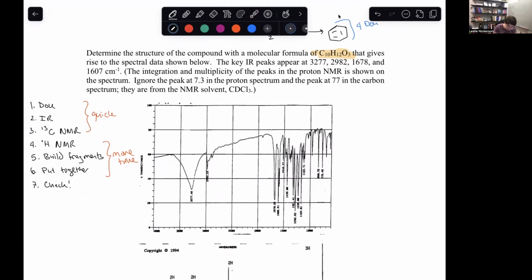Next up, we're going to look at the IR very briefly. The very first thing that's popping out is this broad, weirdish peak over here. And because I have oxygens, I'm going to think maybe alcohol, right? That's a reasonable guess. All of this stuff looks like what I would see with the sp3 CH. So is that the most helpful thing in the world? Not really. Is it possibly obscuring some of the stuff we'd be seeing from the benzene in terms of the sp2 CH? Yeah, probably.